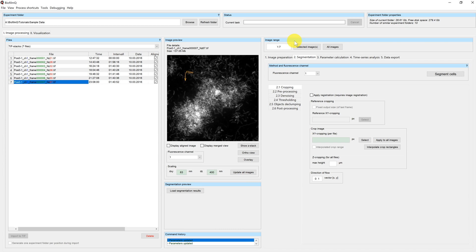Maybe in your images there are several biofilms, but you only want to analyze one specific biofilm and exclude everything else from analysis. The cropping will also speed up the whole process of segmentation as the file sizes will be decreased.